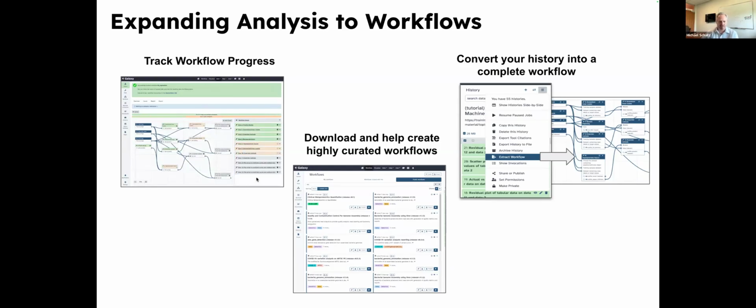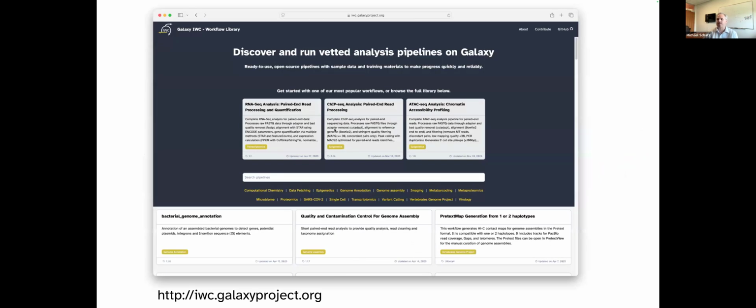So there's a lot of sophisticated support inside of Galaxy for designing workflows, running them, monitoring them, and iterating on them. There's a lot of support there for scientific analyses. And another feature is, yes, you can build workflows on your own, but we also have a growing catalog of really polished, high quality workflows, from something called the IWC, the Intergalactic Workflow Commission, which really carefully builds, studies and validates these workflows so that you don't have to get started on your own. Here's just the splash screen.